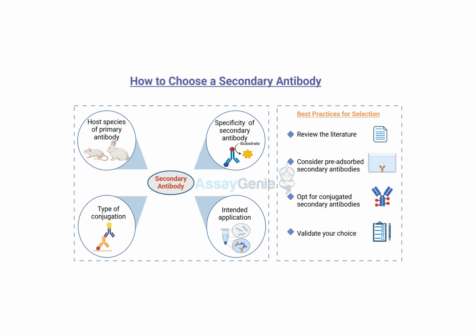So, we've covered a lot of ground here. Selecting secondary antibodies, those controls, even the element of surprise in research. It's been a great conversation. What are some key takeaways that you would want our listener to remember? Well, I think the most important thing is to really appreciate how complex these seemingly simple tools are. Choosing a secondary antibody is not a trivial decision, it can really make or break your research. It's about understanding all those little details, the host species, the conjugate, all of that.